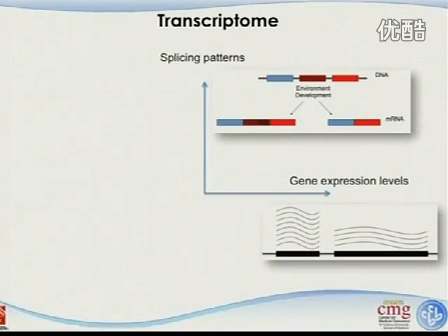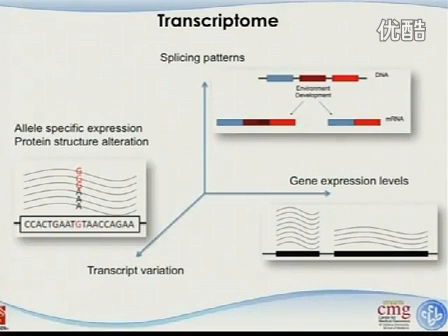RNA sequencing can intrinsically do this pretty well. There are special forms that microarray can do this as well, but you have to use exon junction arrays and something like that. It's a very special design, but RNA sequencing really improved the quality of splicing isoform identification. And the third dimension is variations on the transcripts. We know that SNP arrays can do this type of thing as well.